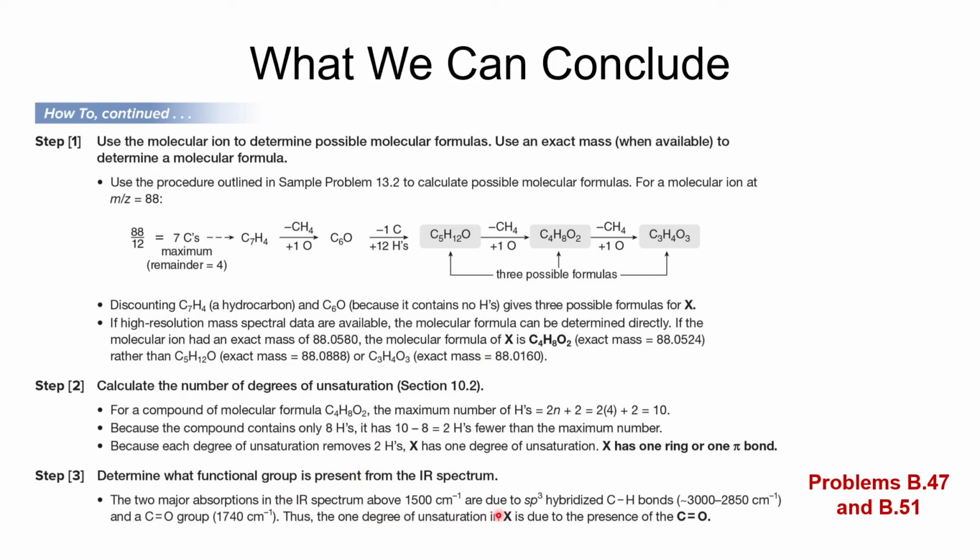And then we know from the functional group that we've got a carbonyl and carbon hydrogens, and that's it. So this one looks like a good possibility. If I were a betting man, I'd say that's probably our best bet because that could include a carbonyl. This one could as well, but we don't see any of the other carbon hydrogens. So I suspect it's this.